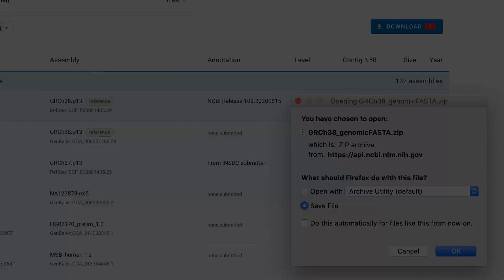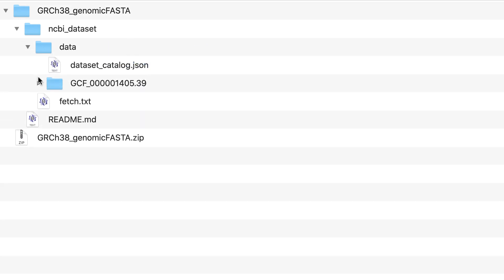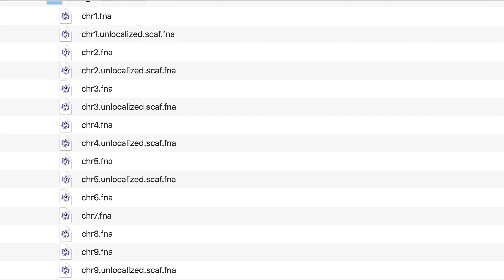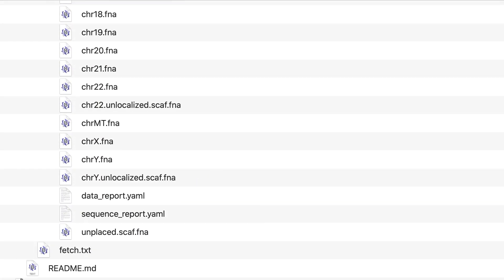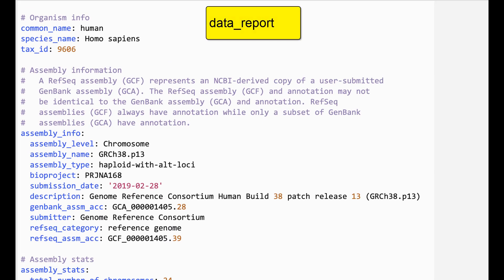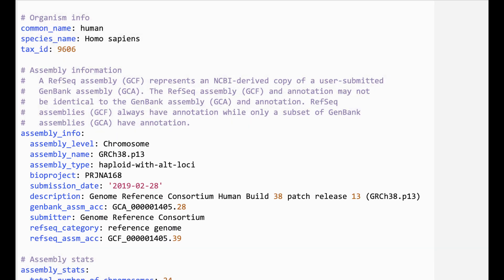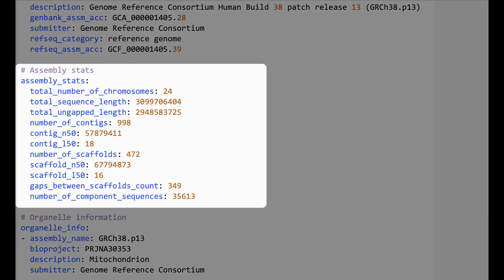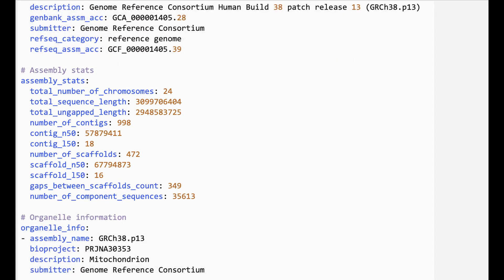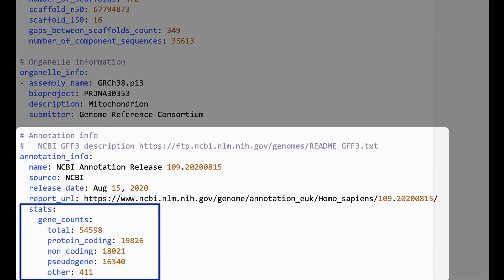Your dataset is delivered in a structured zip file that contains your selected files in a single data folder. The data report includes detailed information on the assembly, such as the assembly name, bio project, and statistics like the contig N50, sequence length, and number of scaffolds. You'll also find summary statistics on the annotation.